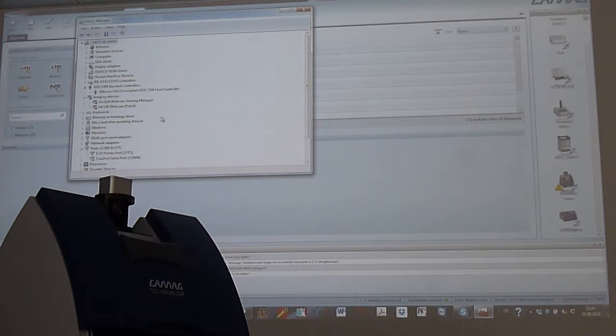So therefore I use this adapter here, this PC card adapter, but as it seems the PC card adapter is not recognized, so I have to unplug it again, and plug it again, and see if it is working, hopefully.